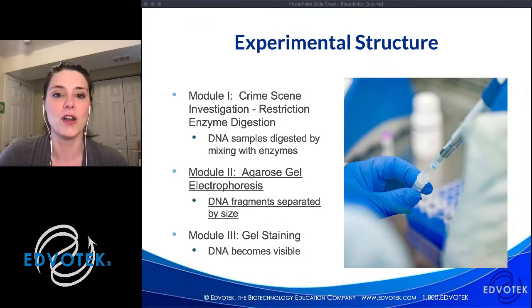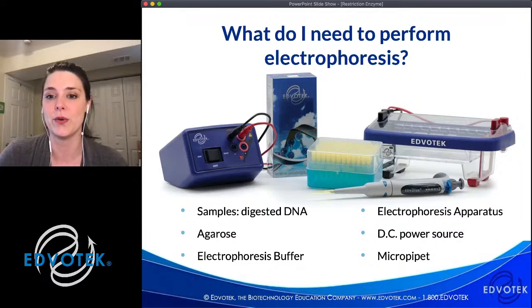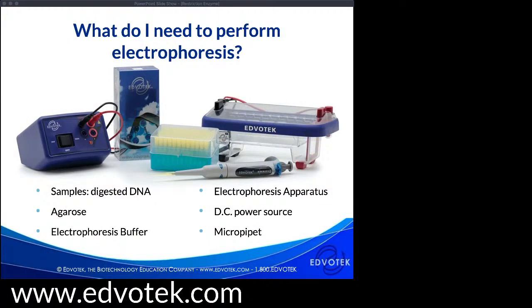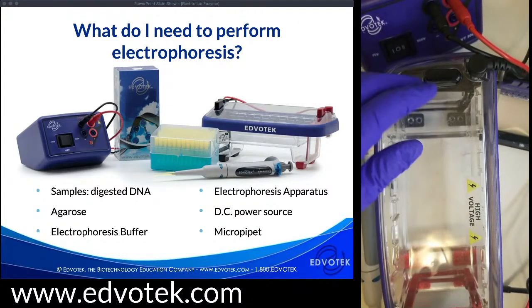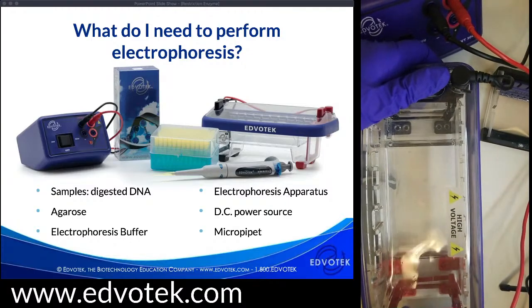Let's talk about electrophoresis while I begin to load our gel. I'm going to switch over to my camera and my lab setup. To do electrophoresis, first we're going to need our samples. Electrophoresis is a super versatile technique — you may have joined me for other live streams where I've done dyes. You can do nucleic acids — so DNA or RNA — or you could do proteins. In this lesson, we are going to do the digested DNA.